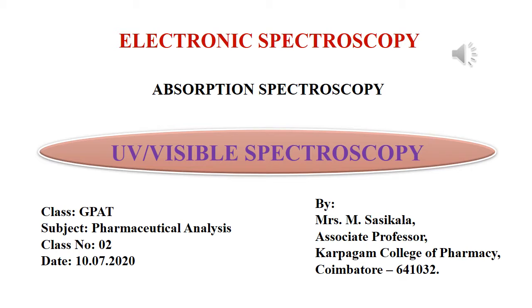As we discussed in the last class about spectroscopy and its types, now we'll move on to UV visible spectroscopic analysis. Here we are going to discuss the principle, instrumentation and applications of UV visible spectroscopy.